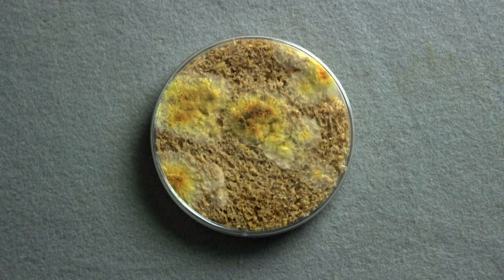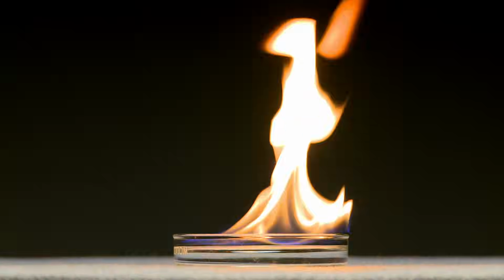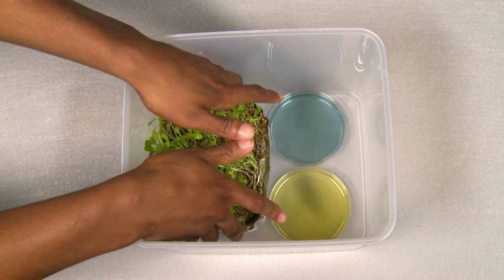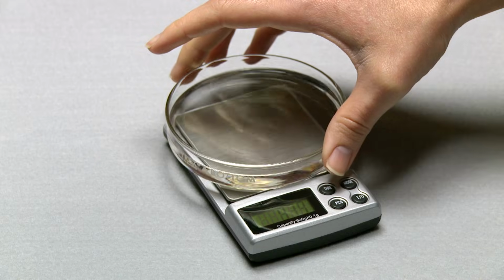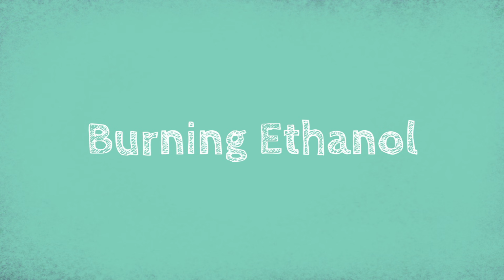Today we're taking a close look at how carbon is transformed during everyday events. Food, fuel, plants and animals, whether they're alive or dead, all contain carbon atoms and store or use energy. We're going to do an investigation and look a little closer to examine what's happening on a very, very tiny scale. Right, and today we're burning ethanol.